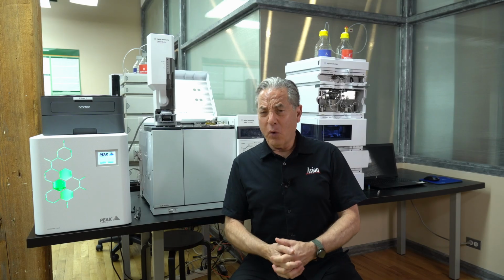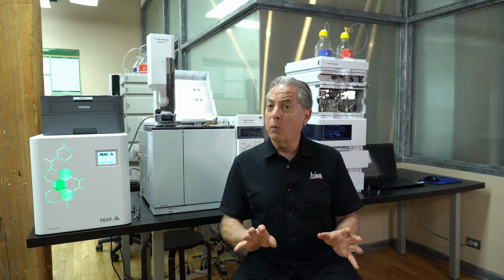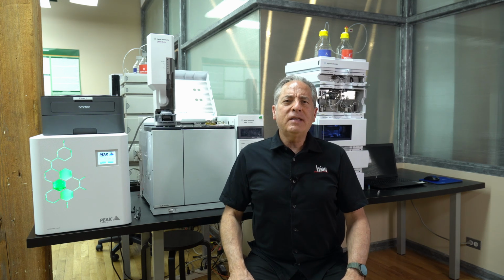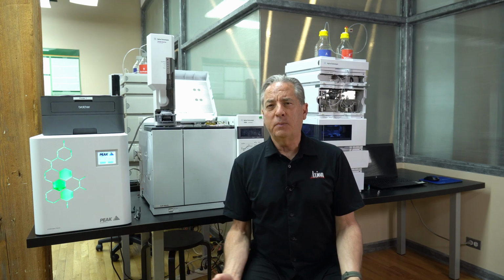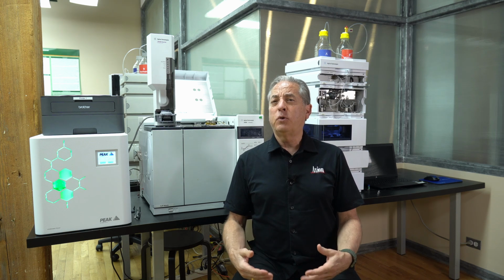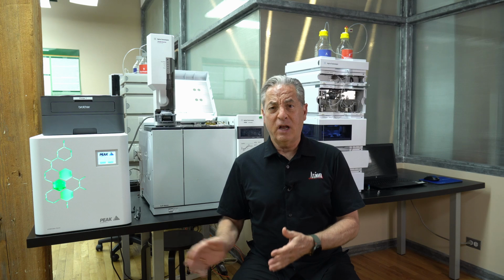Now, for those of you who are interviewing in the pharmaceutical industry, there are a couple of special terms that you should be aware of when you go in for that interview. One is the idea of system suitability. So if the interviewer asks you, what is system suitability? The simple definition is that it's a way to prove that your instrument is suitable for its intended purpose.